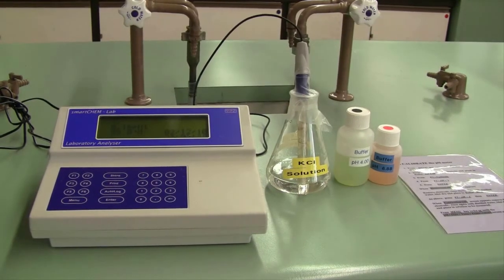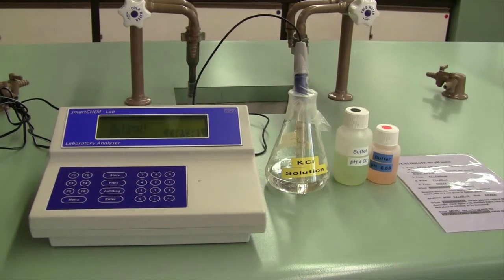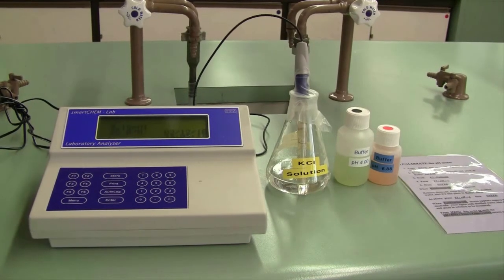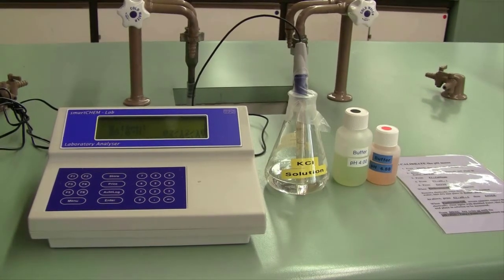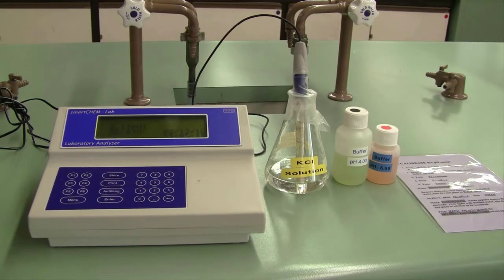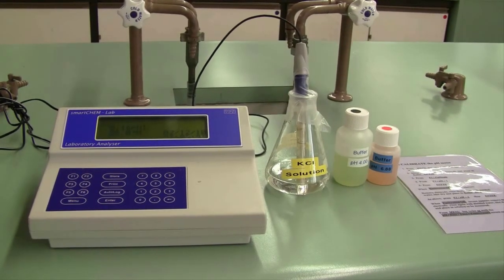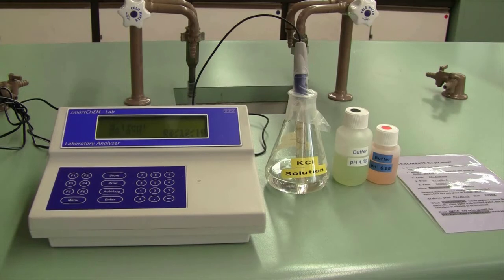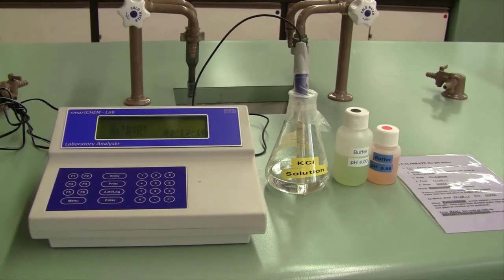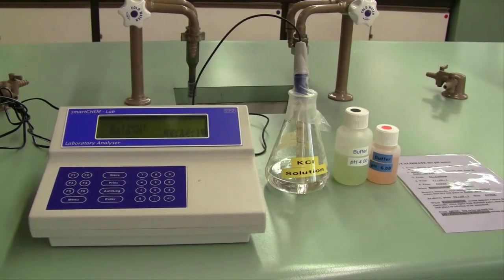Before we begin, I'd like to highlight that when watching this video, please make sure you pay particular attention to the directions involved. People often draw this experiment out over a long period of time. If you follow these instructions, you'll recognize that the preparation of a buffer solution and a pH titration should be a very quick and efficient process. This should not be a long experiment.